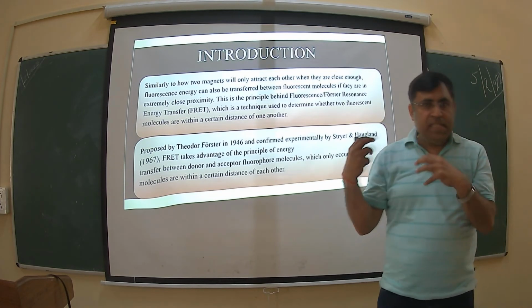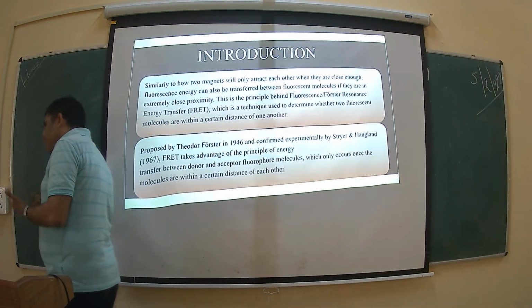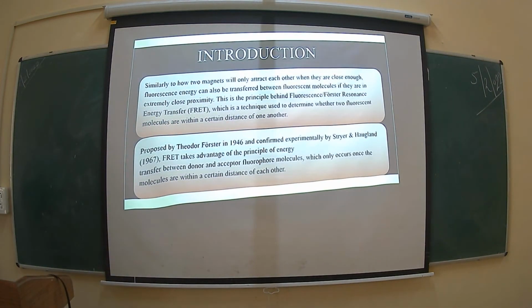So in this phenomenon you will see the protein-protein interaction. Now, it was proposed by Theodor Foster. So why do we call it Foster resonance? Because of the scientist who discovered this phenomenon. It was proposed by Theodor Foster in 1946 and confirmed experimentally by Stryer and Haugland in 1967.